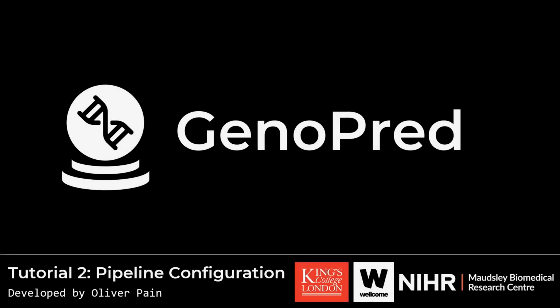Welcome to the second tutorial for the GenoPred pipeline, an easy-to-use, scalable software pipeline developed at King's College London which can be used to calculate polygenic scores. Okay, so in the previous video we showed how to install the GenoPred pipeline.